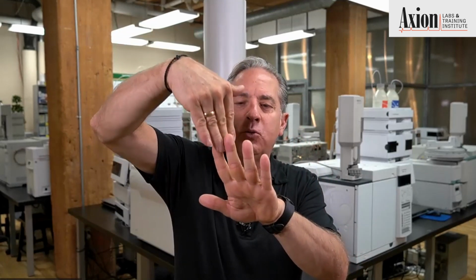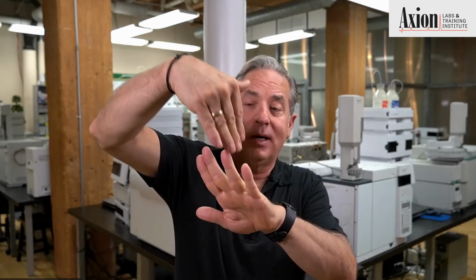So the classic example, there's a couple of PAHs, polynuclear aromatics, and think if I had two molecules with the same number of aromatic rings, 1, 2, 3, 4, 5, and I arrange them in a plane versus 1, 2, 3, 4, 5, where I can arrange them sort of a stair step. Those two molecules have the exact same hydrophobicity, so they would not separate on a reverse phase column in a pure hydrophobic mechanism. But since one of those molecules is flat, it could reach in between the C18, sort of like a piece of toast in a toaster oven, and get more interaction than the crooked molecule, which cannot fit in between. So the polymeric C18s are often called PAH columns, for polynuclear aromatic hydrocarbon.